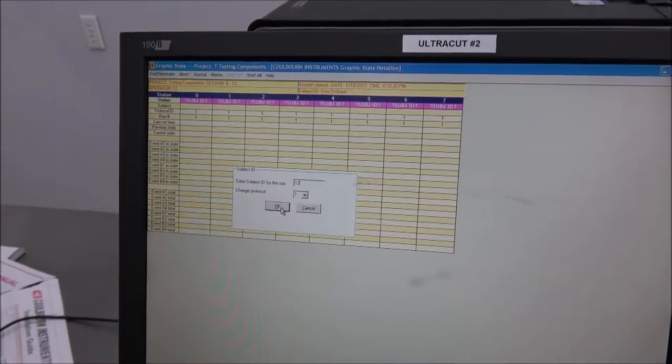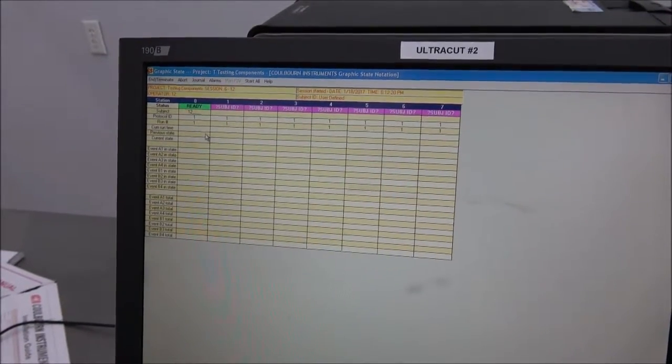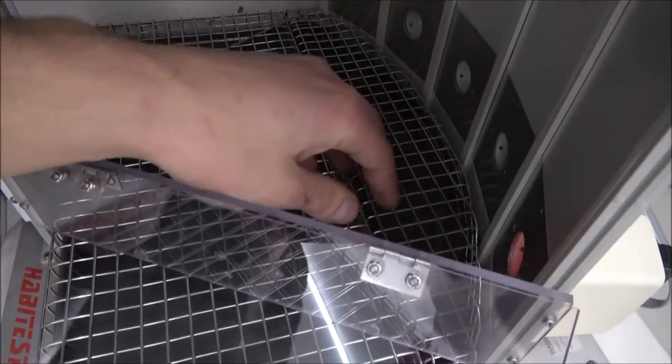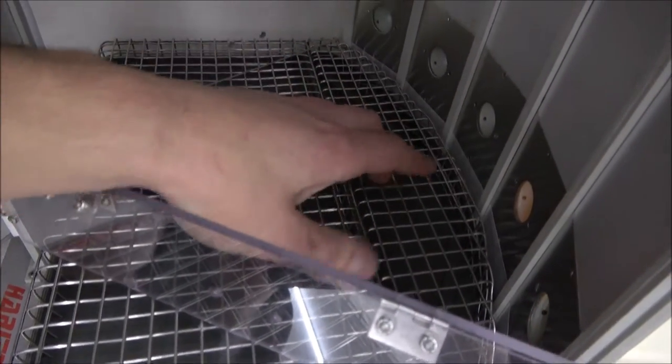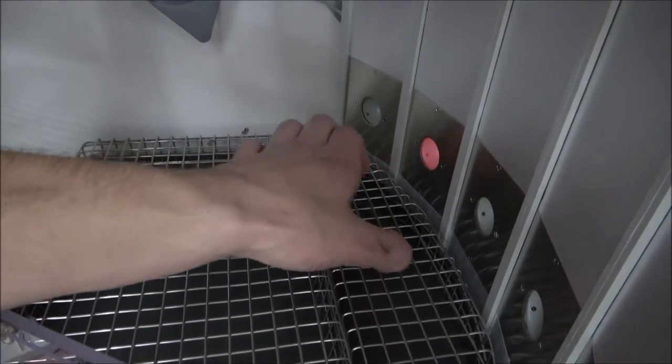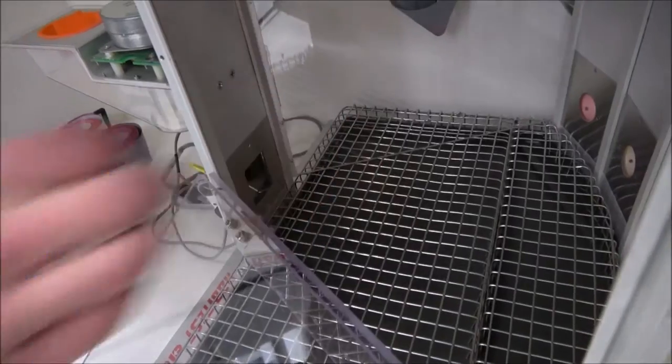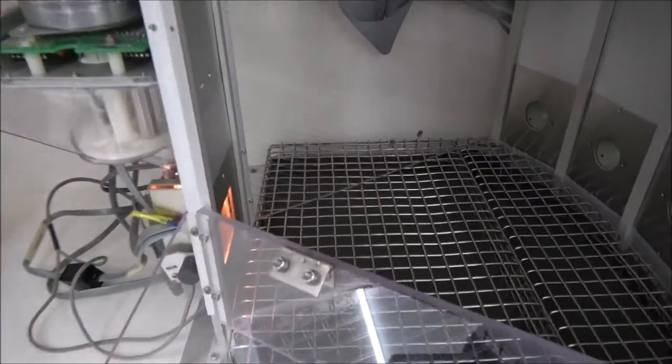We only have the first one hooked up just for this, and we'll go over to the chamber now. So we come in here and we get our first switch, we get our second, our third, fourth, and fifth.